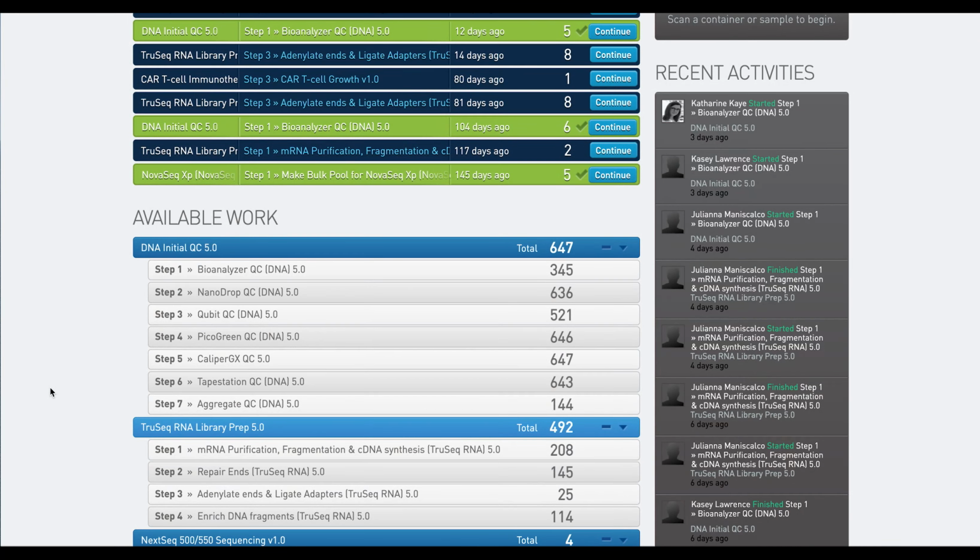We are going to plate our samples onto a plate that already has samples on it. Sometimes in the lab, especially if you're doing a low throughput prep, you may utilize the empty wells on the sample plate for multiple steps throughout the workflow. Clarity can handle this complexity.